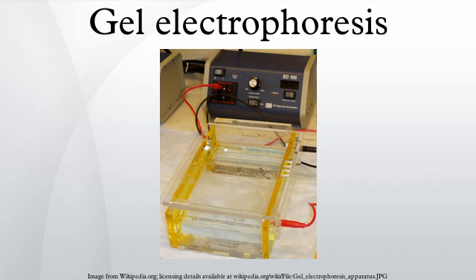Visualization. After the electrophoresis is complete, the molecules in the gel can be stained to make them visible. DNA may be visualized using ethidium bromide which, when intercalated into DNA, fluoresces under ultraviolet light, while protein may be visualized using silver stain or Coomassie brilliant blue dye. Other methods may also be used to visualize the separation of the mixture's components on the gel. If the molecules to be separated contain radioactivity, for example in a DNA sequencing gel, an autoradiogram can be recorded of the gel. Photographs can be taken of gels, often using a gel doc system.